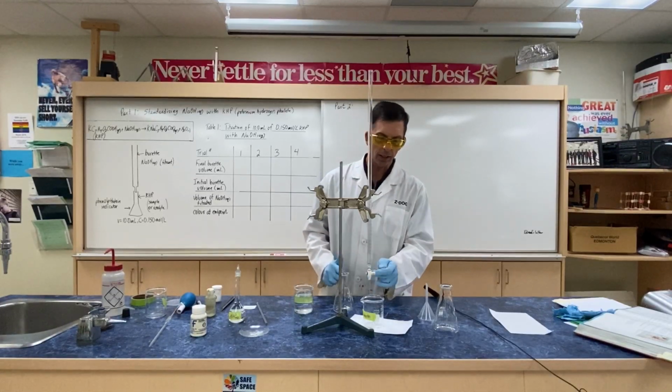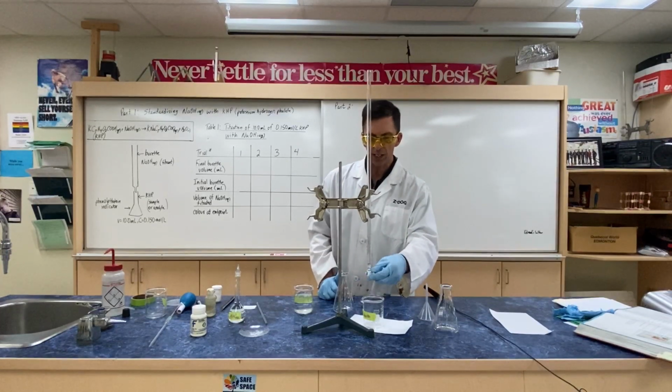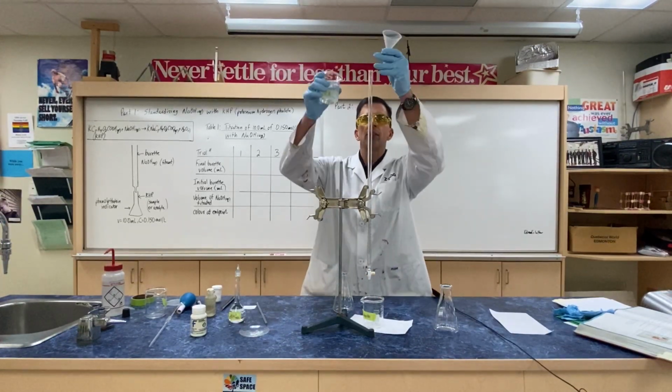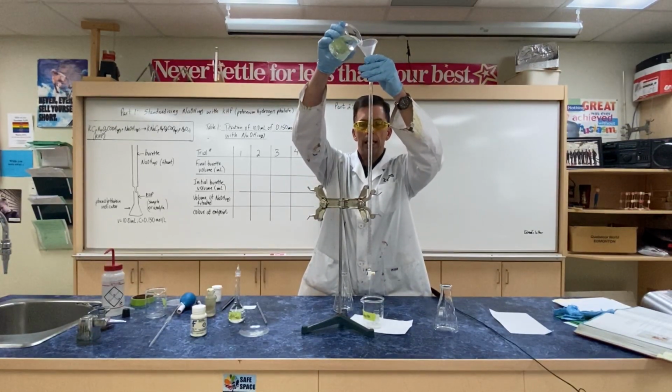Make sure that there are no air bubbles in the bottom of the stopcock. And that's why I'm rapidly opening and closing the stopcock. Now we're ready to titrate. And using a funnel, I fill the burette with sodium hydroxide.